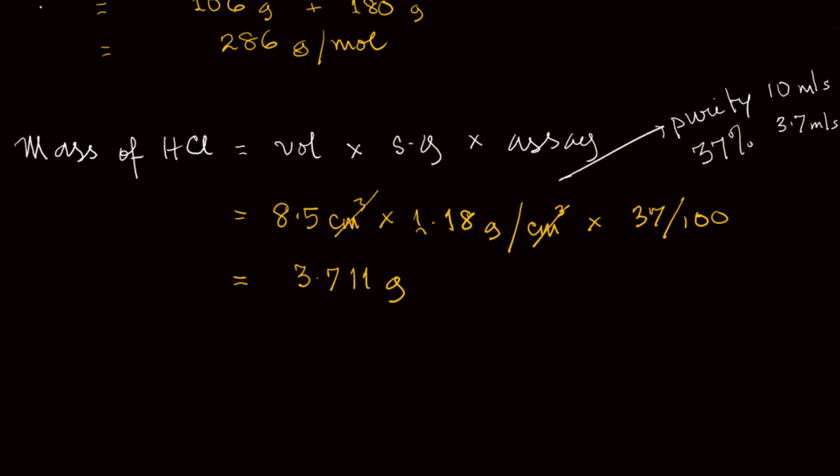Since you are asked to dissolve 8.5 cm3 of the stock acid in 1 dm3 of water, remember you add acid to water, not water to acid.